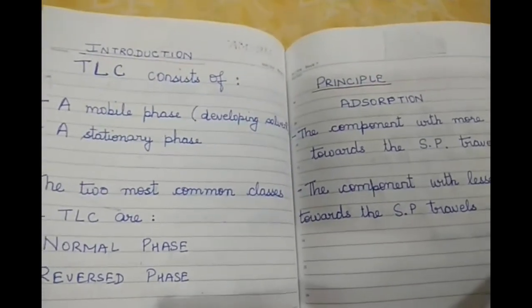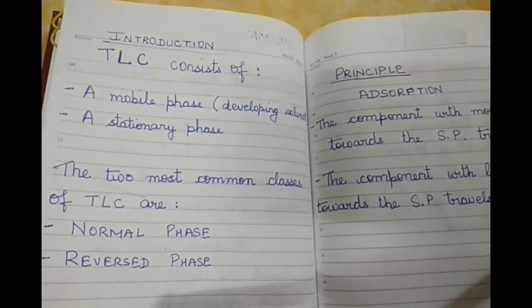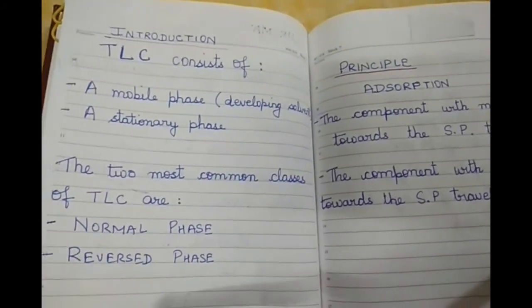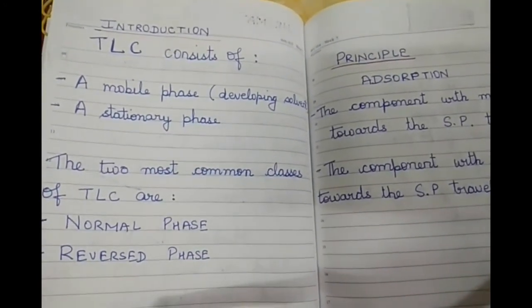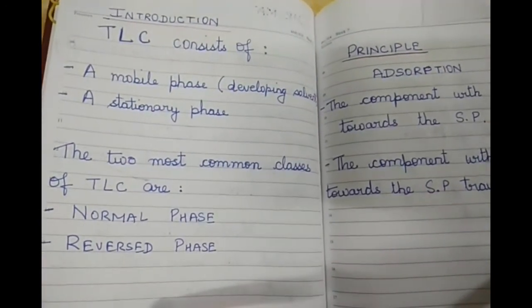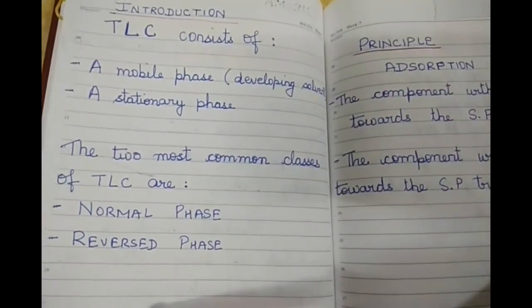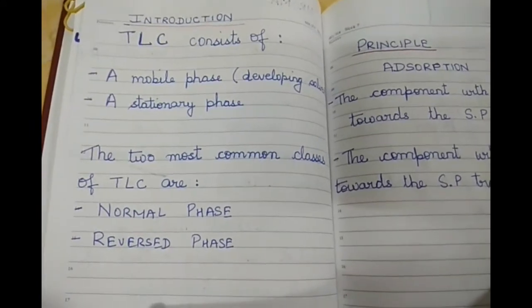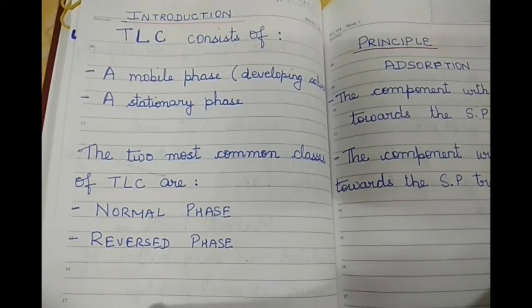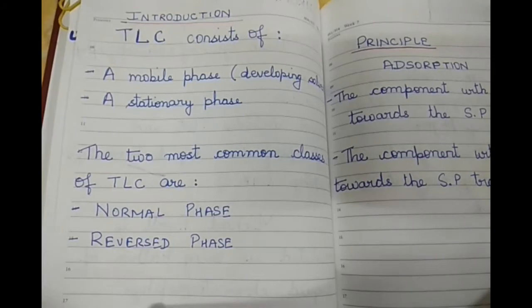Now a brief introduction. TLC is a form of liquid chromatography consisting of first a mobile phase, that is the developing solvent, and a stationary phase, which is usually a plate or strip coated with a form of silica gel. Analysis is performed on a flat surface under atmospheric pressure and room temperature.